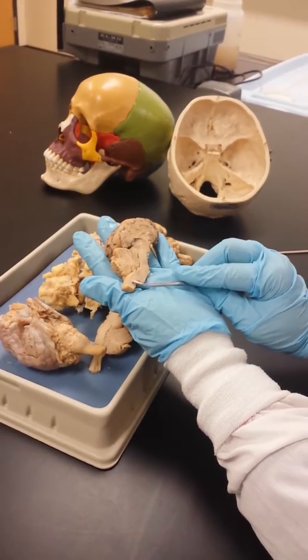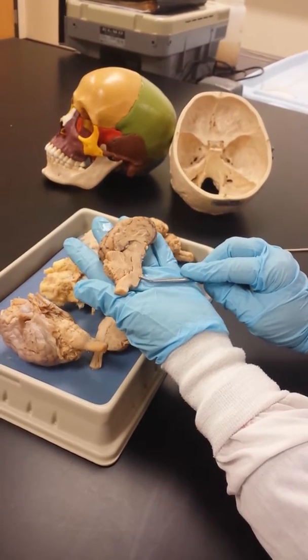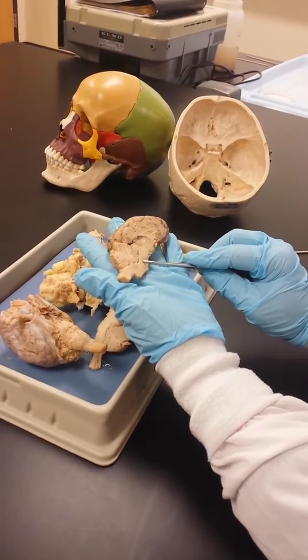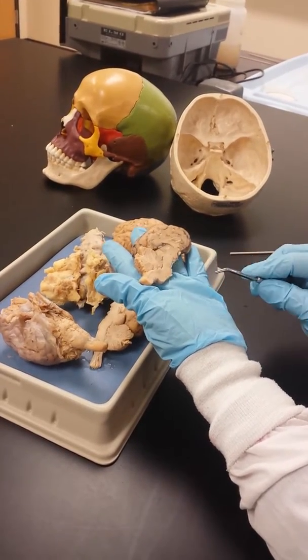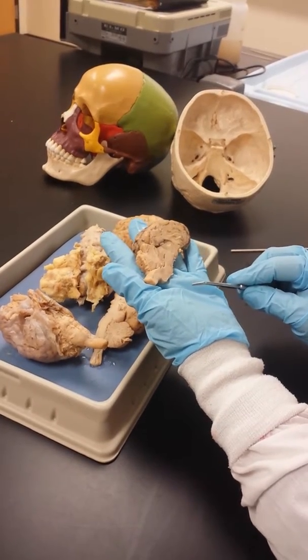So down here, what did we say this was? Spinal cord. So do you see this part right here? That's the medulla. Can you see this little bulge? That's the pons. If you look at it really carefully, you can see the difference in tissue and the type that it changes. Can you see right here how you can see the pons right there?